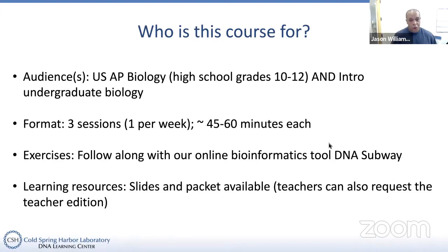You can also follow along using the online bioinformatics tool, which I'll introduce later, DNA Subway. So you'll have all those resources so you really can actually feel like you're accomplishing something. I'll also mention that we have worksheets for students, and we also have worksheets for instructors, for teachers. So if you want to use this as an assignment, we'll also make those available.